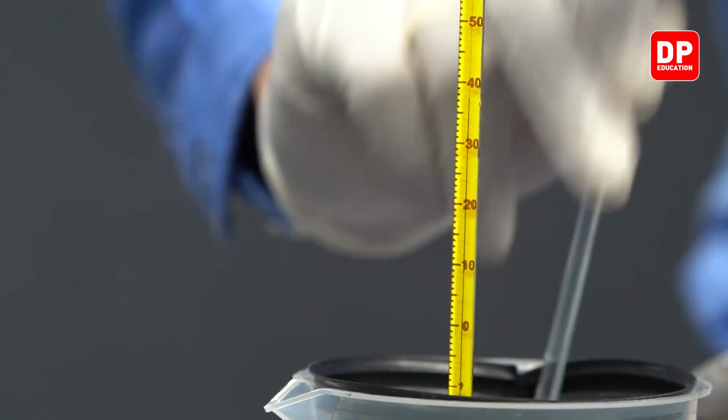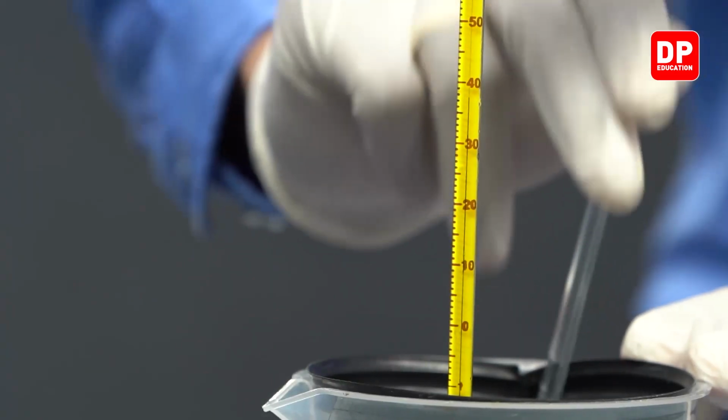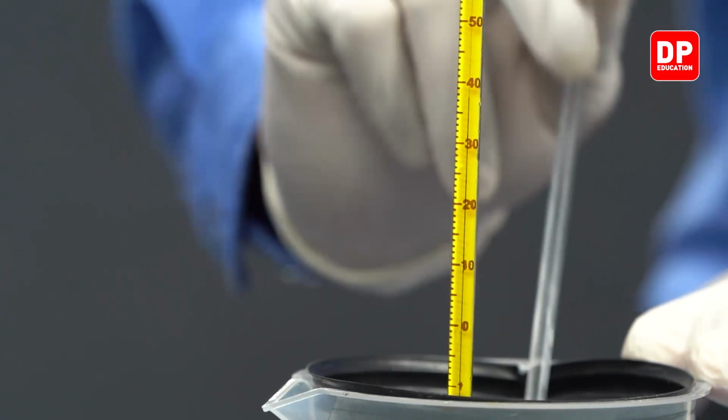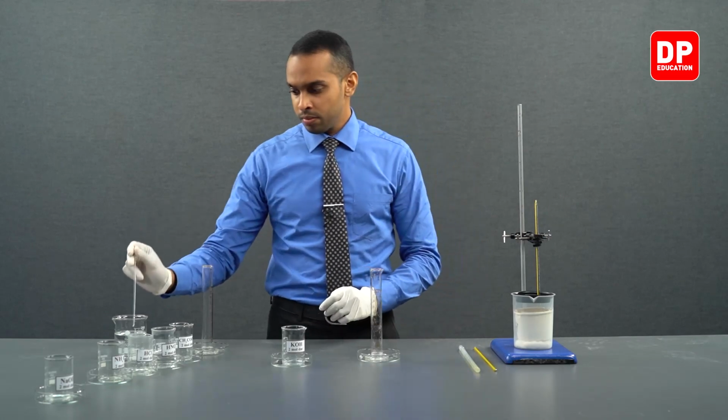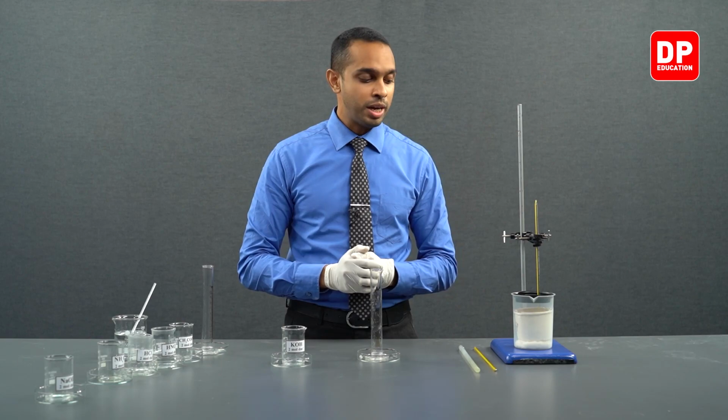We can mix the solution a little bit as well. And we are going to observe the highest temperature this reaction mixture is going to reach now.